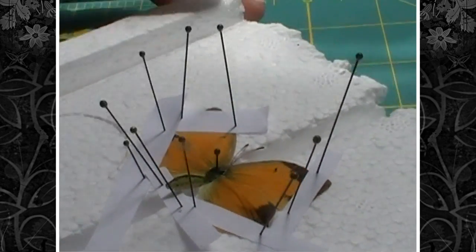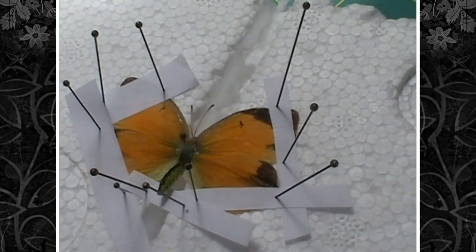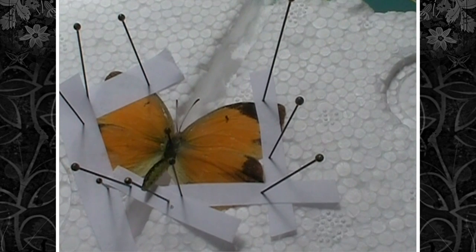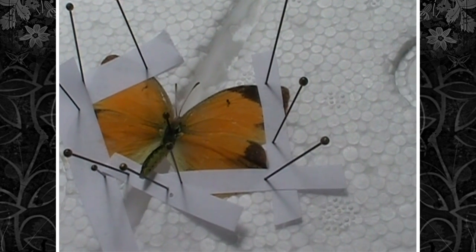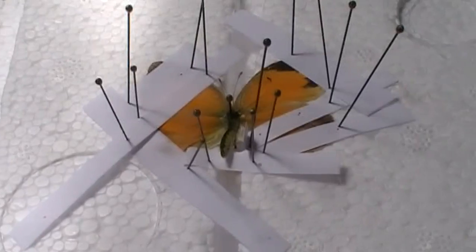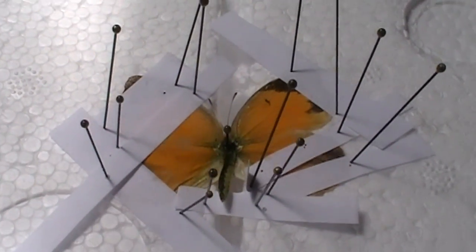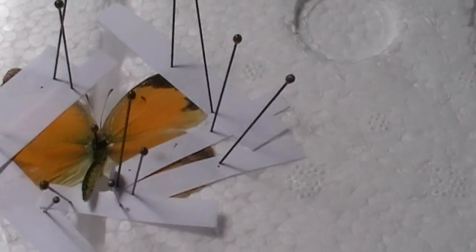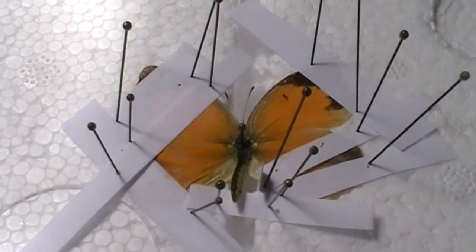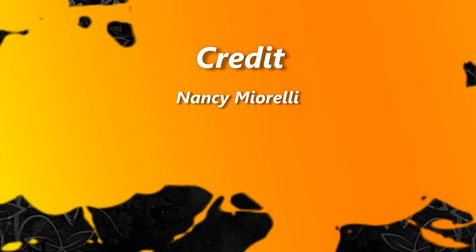You would leave your butterfly spread like this for about a week if it's this size, and if it's any bigger you'd probably want to leave it for about two weeks. You can speed up the process a little bit by putting them under an incandescent light bulb, but you just have to be careful. A couple extra slips of paper can prevent the wings from bubbling during the drying process. And so here you have it — a spread butterfly.